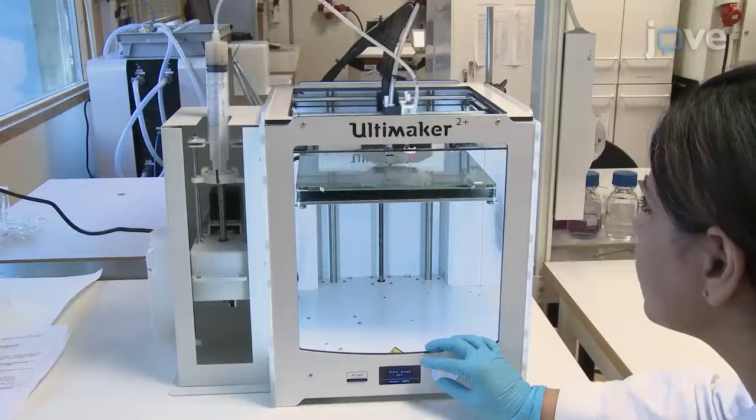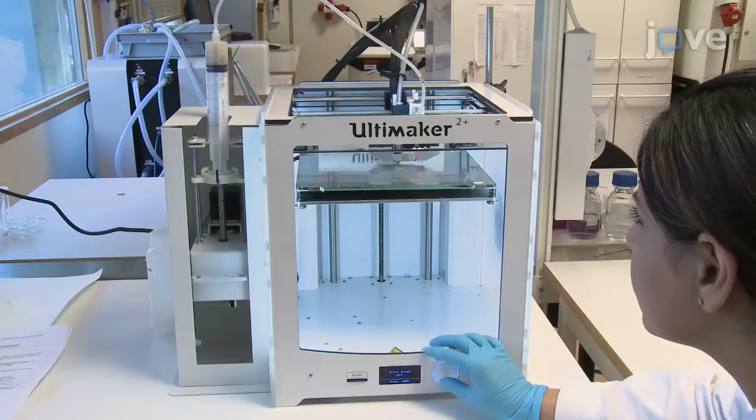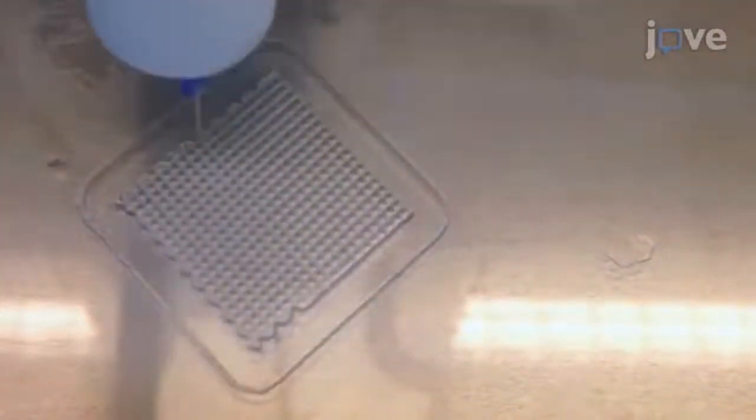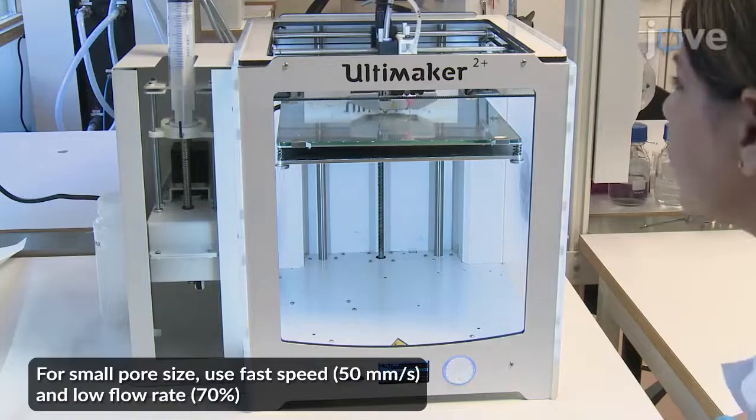From the SD card, select the saved files for uniform and gradient porosity scaffolds and start printing. If needed, adjust the speed and flow rate accordingly.